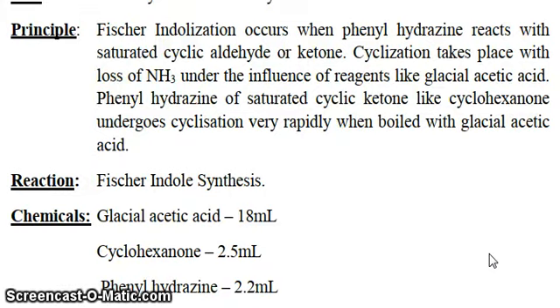Today in this video, I am going to talk about the preparation of tetrahydrocarbazole, and this is a very common practical in the organic chemistry lab. So I hope this video will be good for you. The aim of this experiment is to study Fischer-Indole synthesis. So what is the principle behind it?